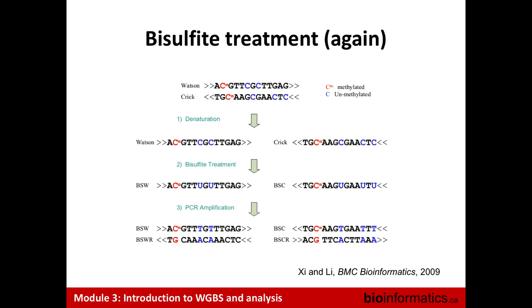I think the bisulfite treatment won't change those, right? I think the bisulfite treatment is restricted, but even without that, it's complicated enough, right? So here's a toy example that shows again what's happening.